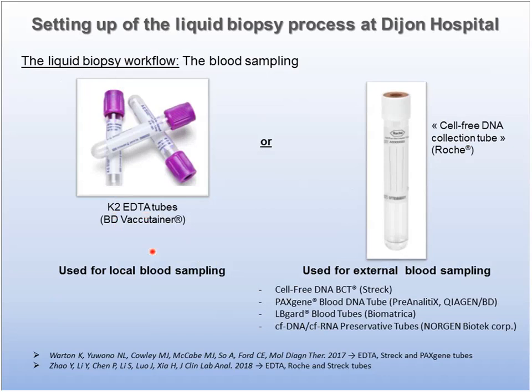And for blood sampling that is performed far from our hospital, we use cell-free DNA collection tubes from Roche. You have to know that there are several other commercial tubes available, and you see here some examples. We did not test all of them, but we know that we obtain good results with Roche tubes. And you have here two recent publications comparing some of them, including the tube from Roche.